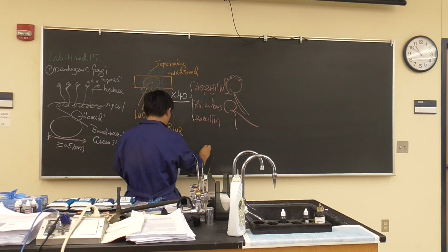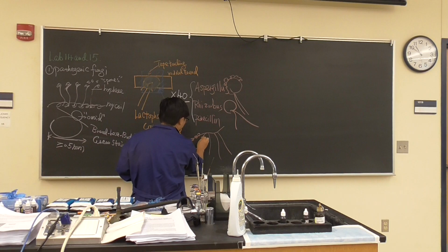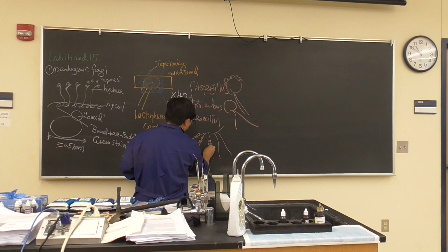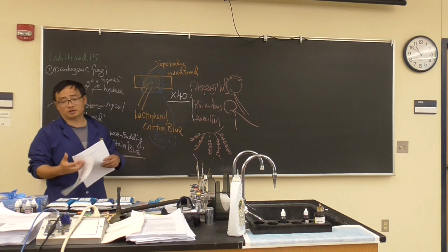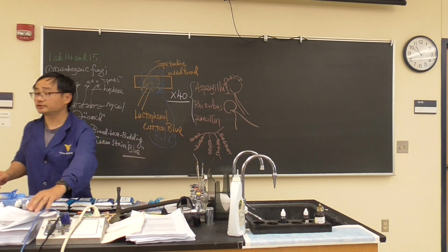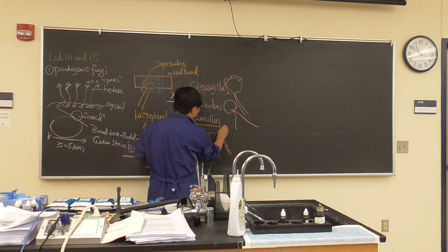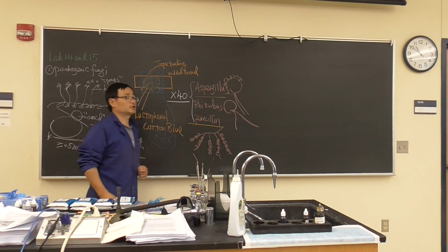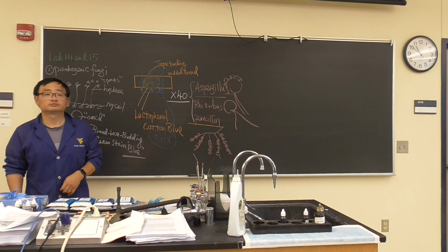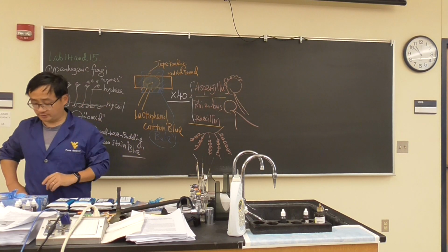What does penicillium look like? It looks like that. Then lots of hyphae, conidia we also call it. It's a spore, but we call it a conidia. So your job is to figure out which one this is. It could be any one of those. Lots of people found the penicillium last year. Sometimes you will find Aspergillus, and sometimes you find Rhizopus. It's a very interesting test. So that's the first job.